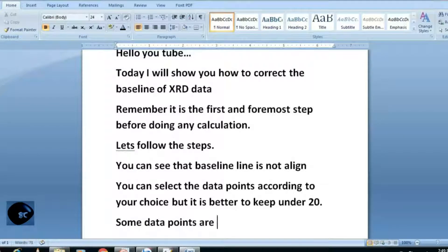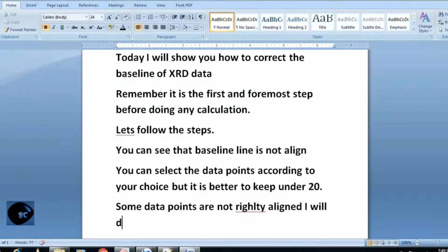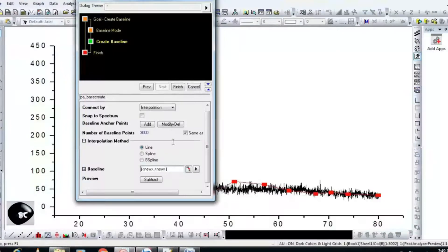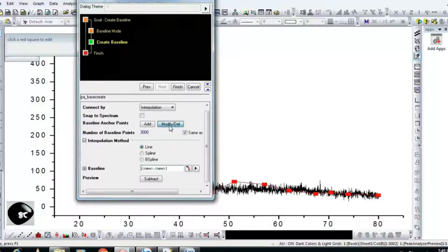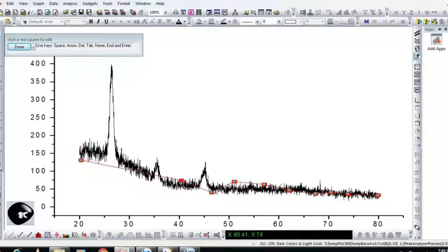Data points must be rightly aligned with your XRT spectra. If they are not, do it manually — this is the key step. Hit Finish.